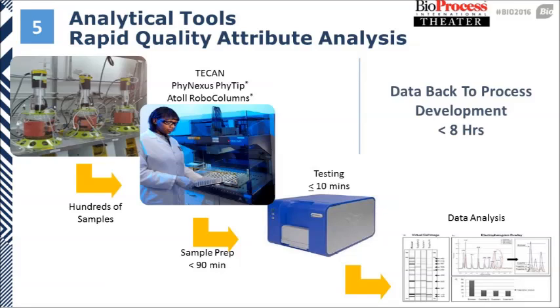This was actually one of the first projects that we did in this area, implemented a TECAN sample preparation. So we essentially can prepare hundreds of samples within less than 2 hours and submit those to the analytical testing. And then using rapid analytics, where rapid means less than 10 minutes per sample, we can essentially turn around hundreds of samples within 1 day. So the target that we routinely achieve is pretty much 8 hours turnaround.